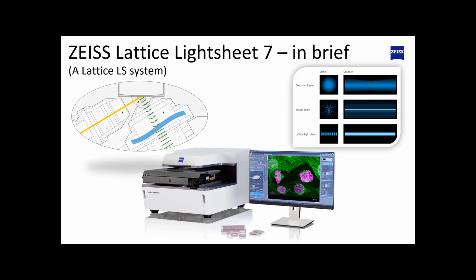The important part about the lattice light sheet is that it doesn't have the constraints of the Gaussian waist beam, with its relatively thicker sectioning illumination, but it uses a nonlinear technique called Bessel beams that are bunched together through optical engineering into a single lattice.